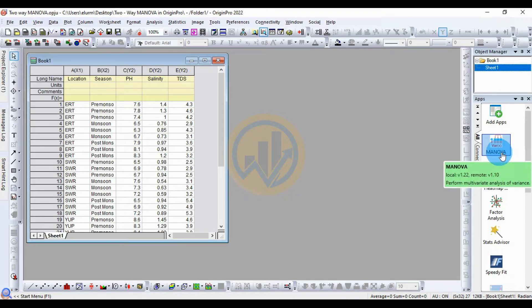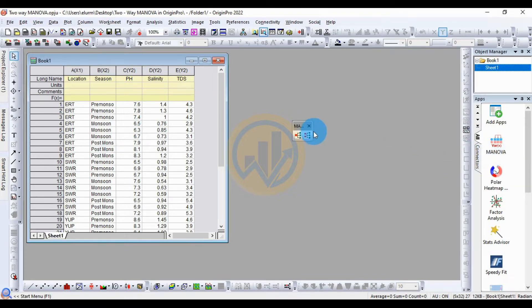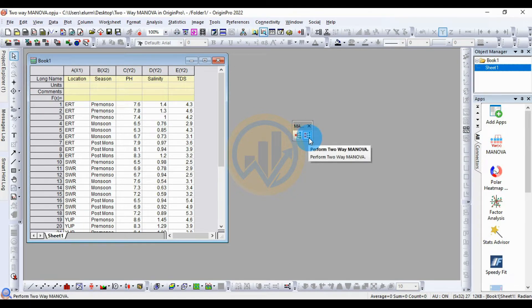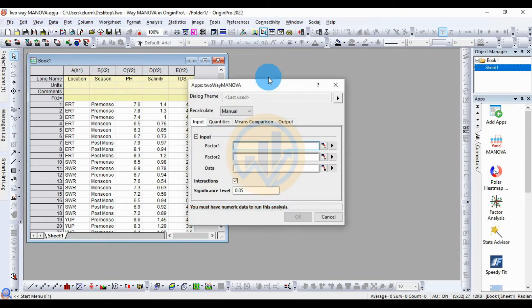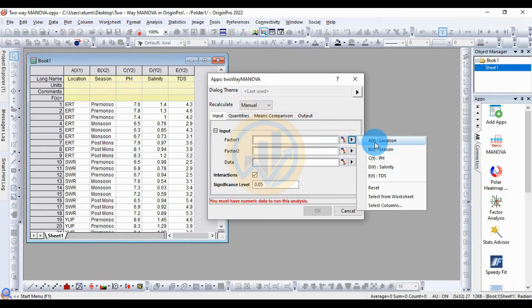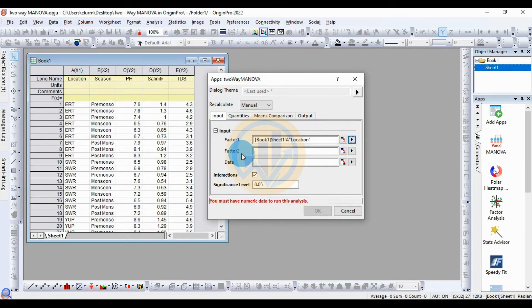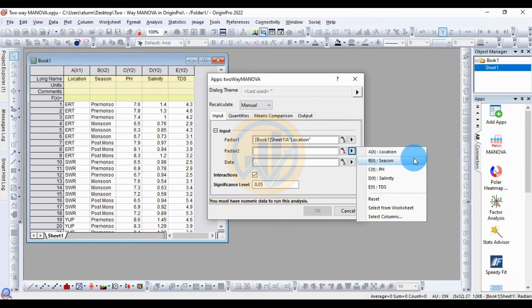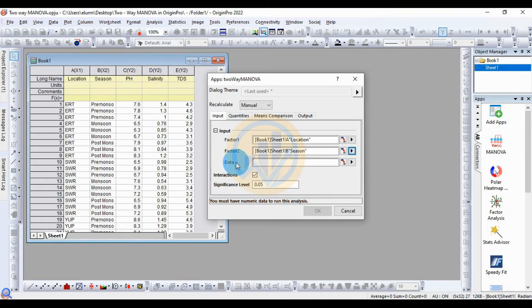For the MANOVA calculation, the app installation method was already explained for the one-way MANOVA. Go to the topic, first click the MANOVA app icon to open the mini window. The first red symbol is for the one-way MANOVA, the second one is for the two-way MANOVA. Click the two-way MANOVA to open the new window. Factor one is the independent variable location, the second factor is season, and the data fields are pH, salinity, and TDS.